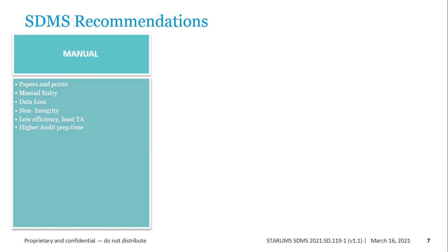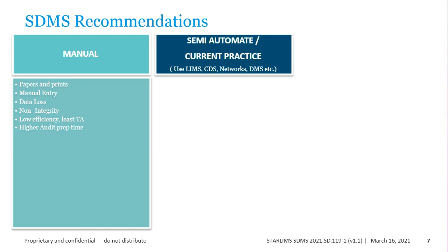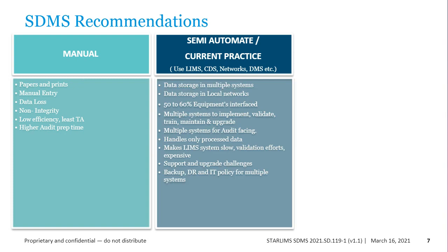And we also get to see what I would call semi-automated, which is the most current practice in the market today. I would say 80 to 90% of us currently fall under this category, where you have a LIMS, or you may have an SDMS, or you may have CDS networks, or you use a combination of all these tools to do the equipment integration and data integrity aspects. So what happens in these cases is they're good. They're the only available solution today, if you look at the last 5 to 10 years.